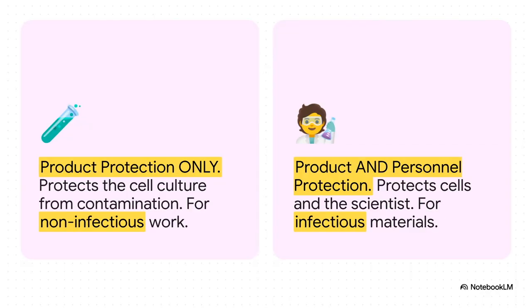So your Biosafety Cabinet or clean bench is the frontline defense. It needs the same precise multi-step treatment. Remember, if you're working with anything that could harm you, like Plasmodium falciparum, you must be in a Biosafety Cabinet, which protects both you and the cells, not just a Laminar Flow Bench, which only protects the cells.